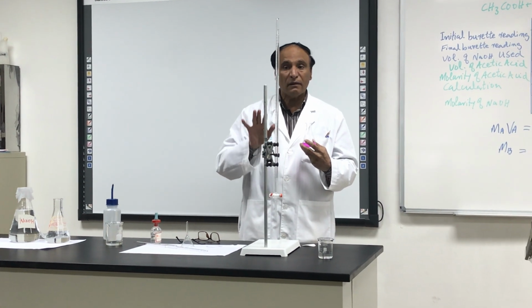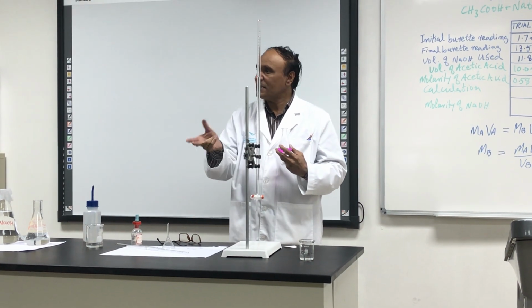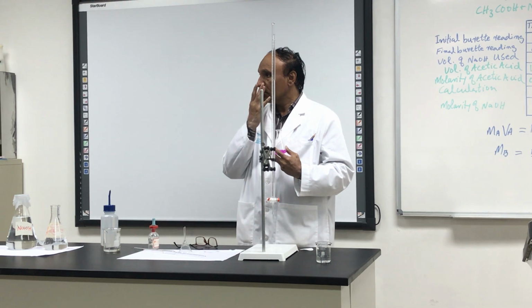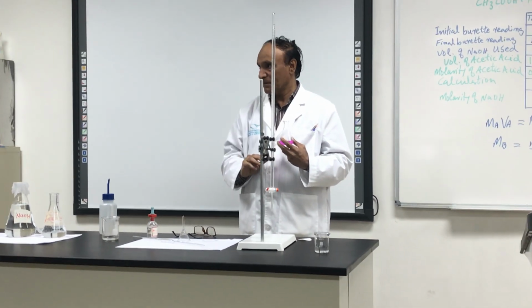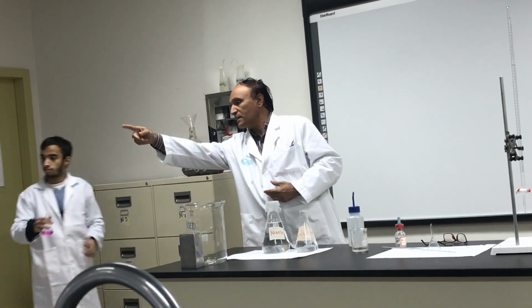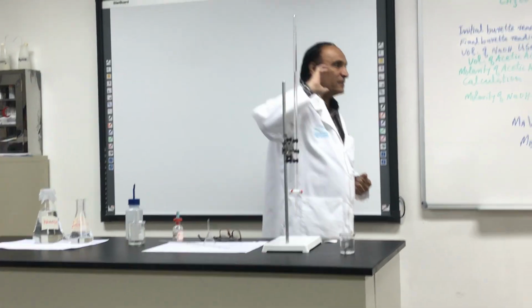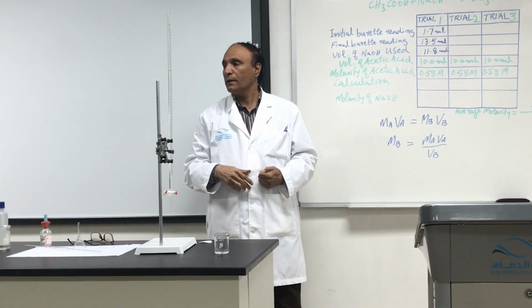Now, after doing this one, the students will exchange their work. So now the second student will do the titration. Can you please wash it? Please wash with the tap water. Just wash, no need to wash with the brush because there is no precipitate, no solid thing inside.